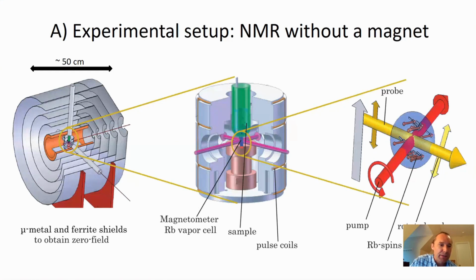One way of establishing such a low magnetic field is to take several layers of mu metal. Each layer of mu metal will provide about a factor of 10 to 100 in shielding, so that by the time you have put 5 layers around, you are in the regime that you want to be in, where there's absolutely no more magnetic field as far as the spins are concerned. Then on the inside of those shields, we set up an NMR tube, which is in green in the middle of the slide. This is where we generate polarization in the spin system.